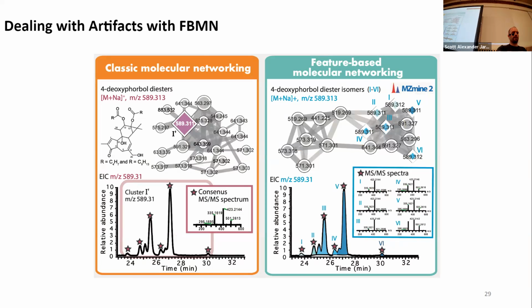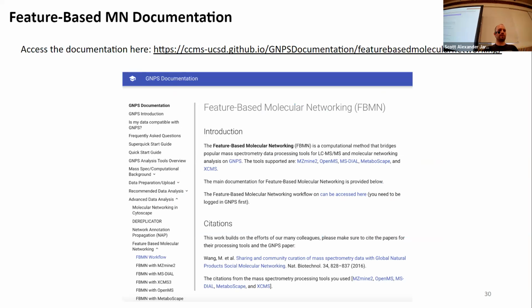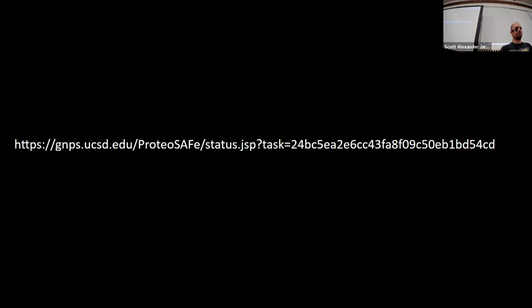All right, I think I've talked enough about the differences. Very importantly, we have extensive documentation online. If you're on the GNPS site, there's a documentation button at the top, and a lot of people spent a lot of time writing detailed documentation for all the different workflows. So if you get lost, feel free to take a look in there as well. And hopefully it's easy enough to guide you through the analysis, even without the workshop or the recordings later. And I think that's pretty much it.